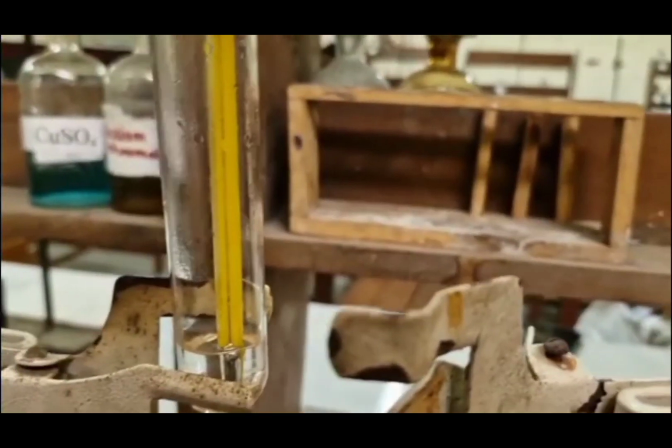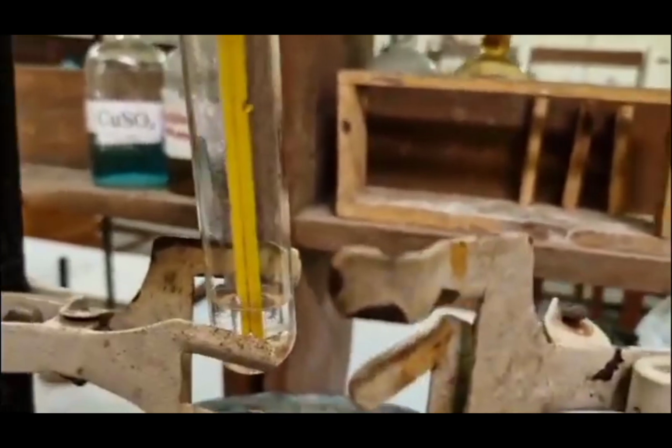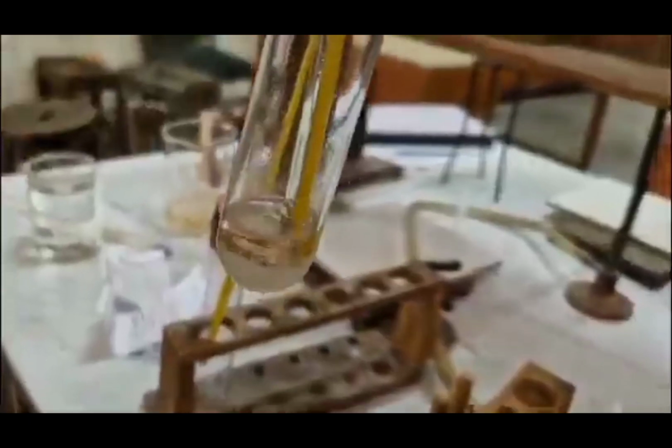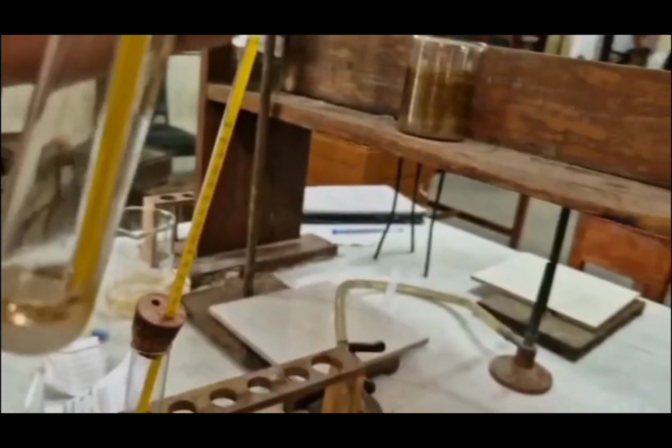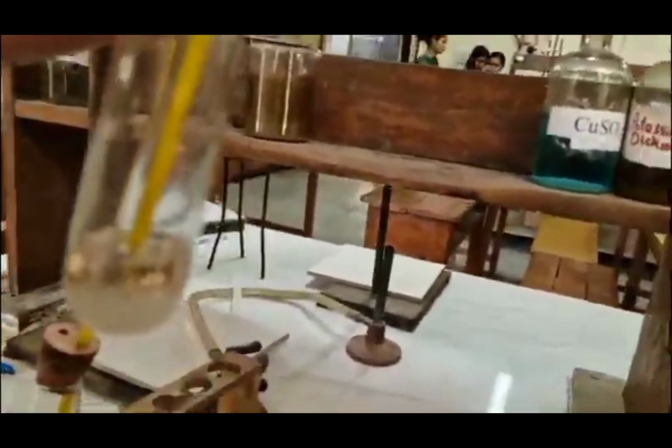Here turbidity disappears again and note down the temperature. In our NaCl phenol water system, again turbidity disappears and note down that temperature.